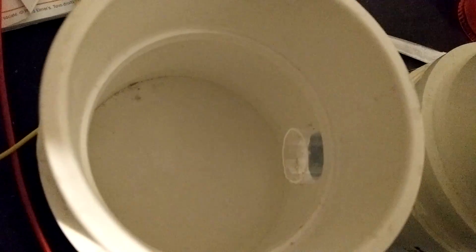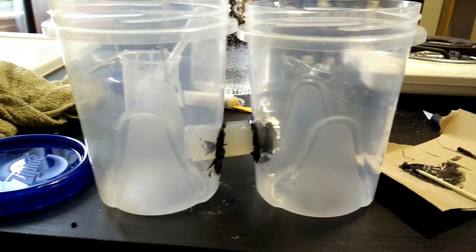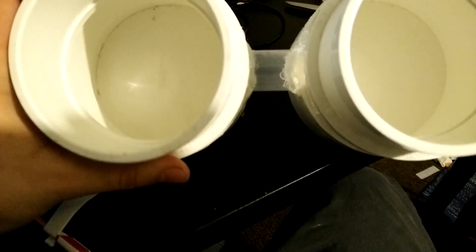I used some scrap acrylic I had lying around, but if you don't have any be creative since anything watertight and not metal will work. I secured mine together with JB Weld. You could try hot glue but it's a nightmare to get it to stay sealed.